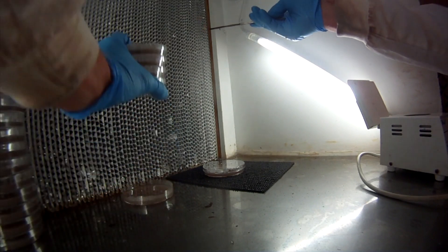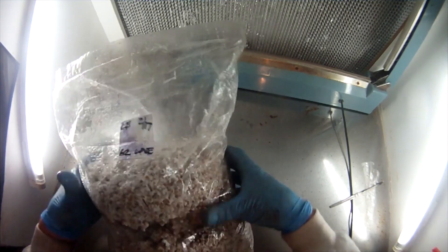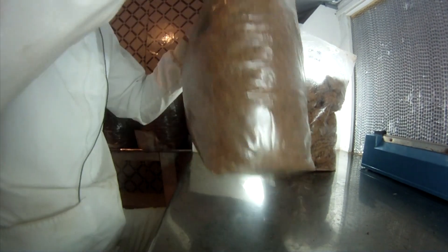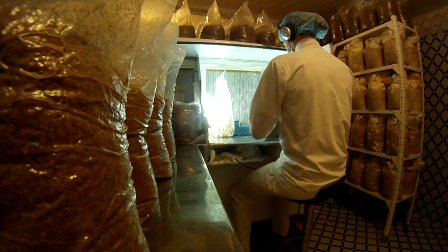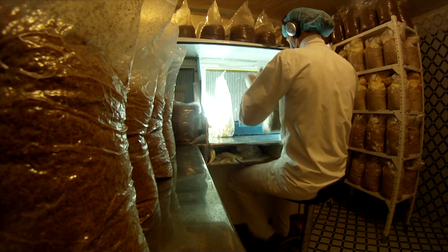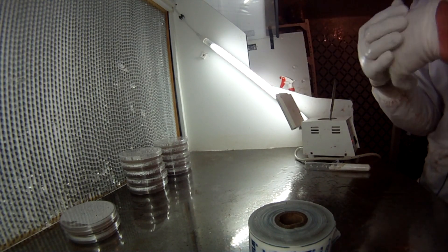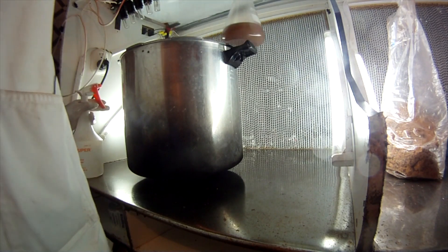And that's where all the transfers happen — transferring from petri dishes to petri dishes, to test tubes, to grain blocks, from grain blocks to final fruiting blocks. It all happens in the space between the HEPA filters on my laminar flow hood and my hands. My hands are covered with rubber gloves and they're periodically alcohol sprayed, but still it's just not enough. So that space in between is what matters.